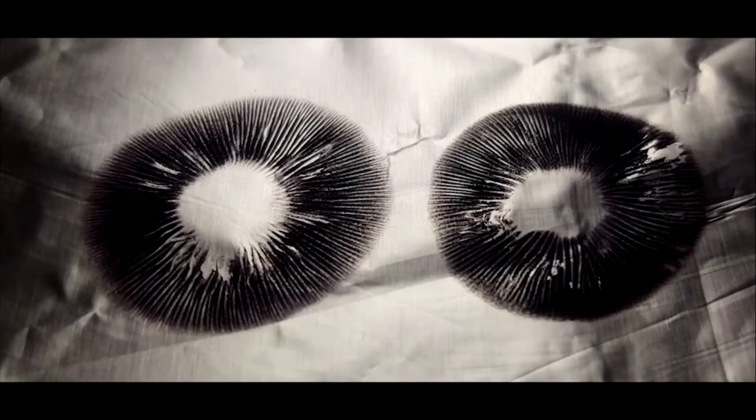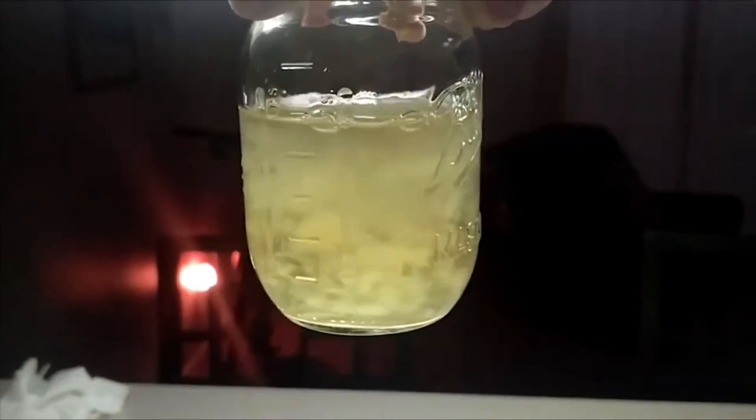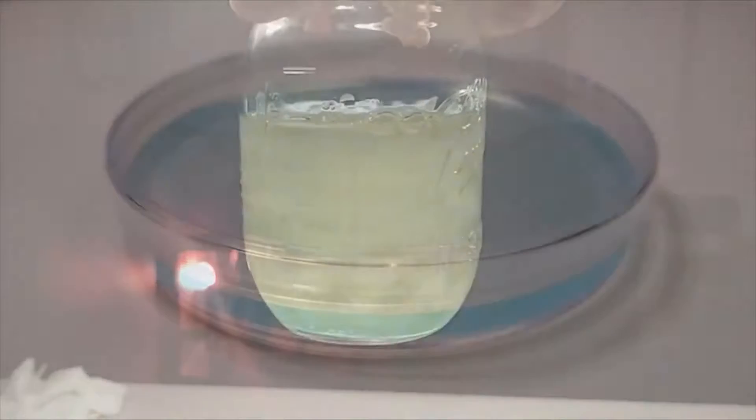When working with spores or cloning best fruits, it is always our goal to create a liquid culture. Liquid culture is mycelium suspended in nutrition. It's like a liquid petri dish without the agar in a jar.